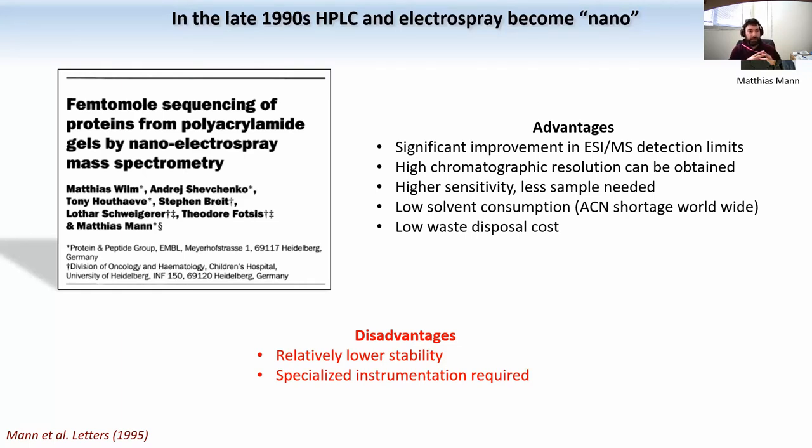Even now, you will see all of these conferences on single cell proteomics growing like mushrooms. I would say we are not really doing single cell proteomics with the same efficiency as we analyze normal proteins yet, but we are going in that direction. And the characteristic of people that analyze single cell proteomes is that they use chromatography at a very, very low flow rate. Now the flow rate range when people run single cell proteomics is 20, 30 nanoliters per minute.